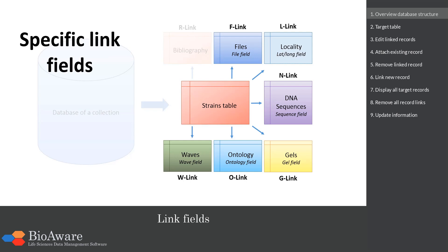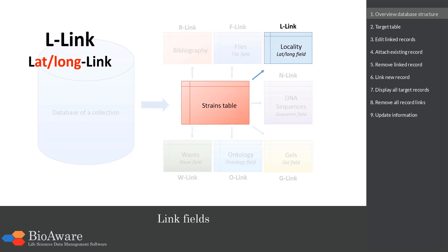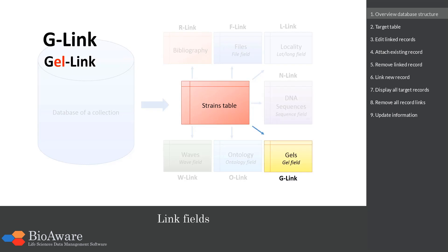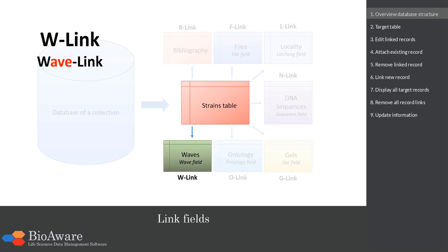We also have specific link fields. They are created so they can be used for the analysis tools, such as the identification or the clustering. Contrary to the R-link field, we do need specific fields in the target table. For example, we can create a file link field or F-link pointing to a table containing a file field. The L-link field points to a table containing a latitude-longitude field. The N-link field points to a table containing a sequence field. The G-link field points to a table containing a gel field. The Ontology link field points to a table containing an ontology field. And the W-link field points to a table containing a wave or W field.